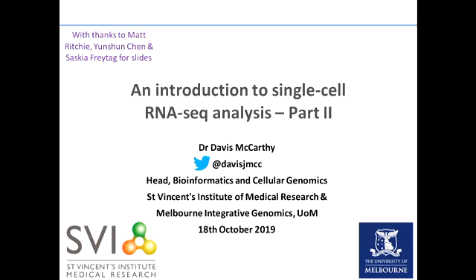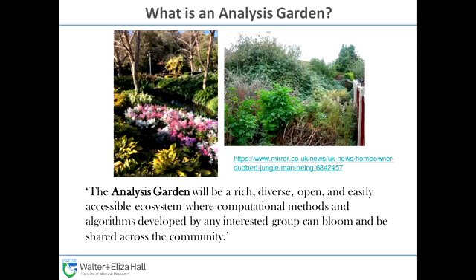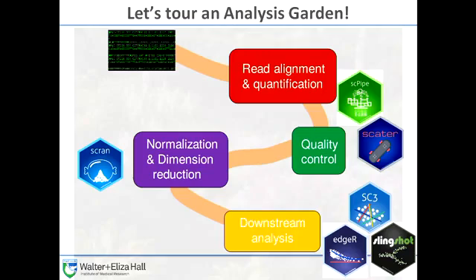So from what I understand, Pete took you on the first steps through an analysis garden in single-cell RNA-seq data, and gave you an introduction to some of the key steps to start with, so going from the FastQ data, the raw sequencing data that we get out of experiments in this area, through the big picture of what we want to do and can do with some of these exciting single-cell technologies that have been available now for the last 5 or so years and are really gaining in popularity.